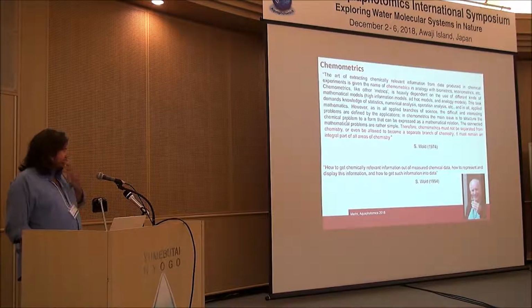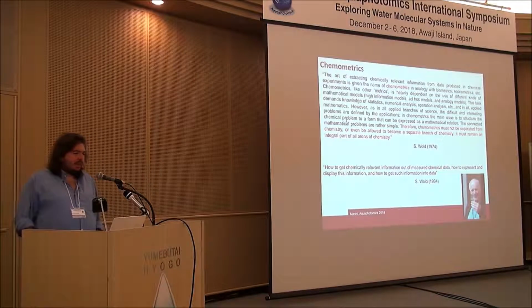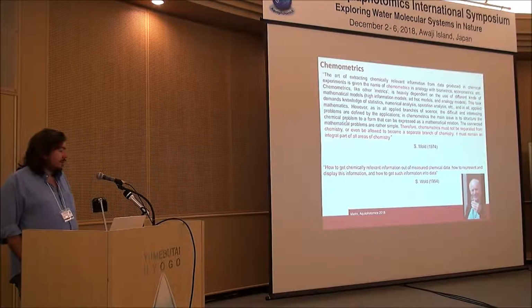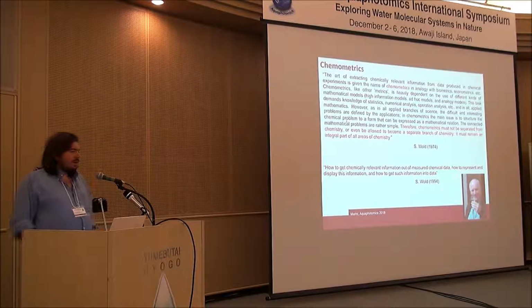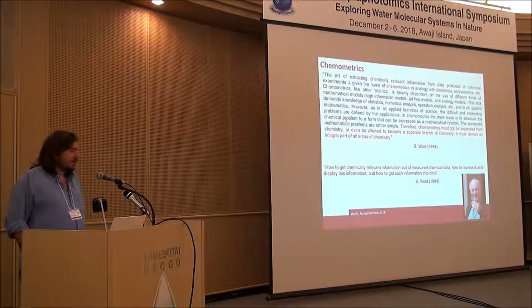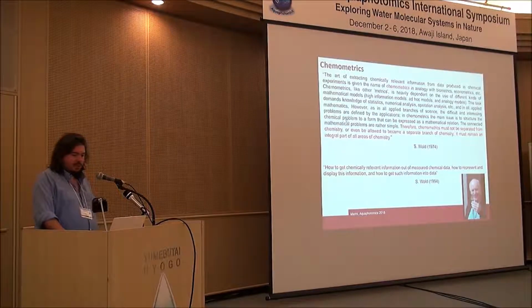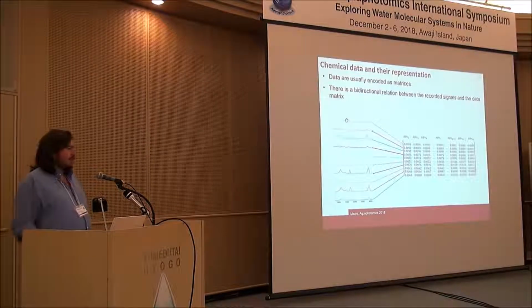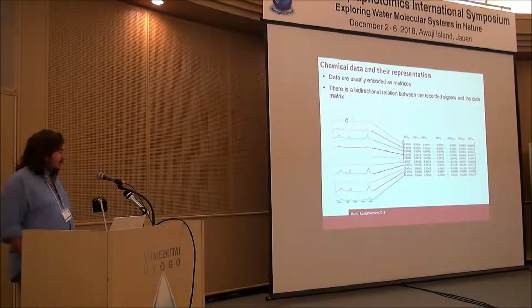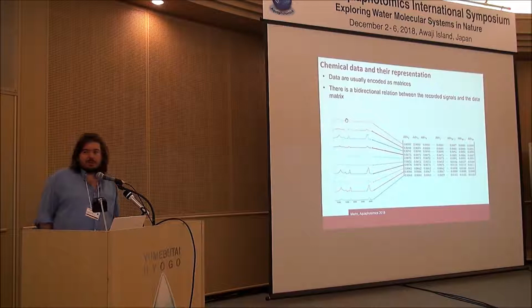Chemometric tools, that means the statistical and mathematical approaches that are applied to the experimental data, in this case the spectroscopic data, for extracting relevant information, are a relevant part of the toolbox that can be used for processing the experimental data within the context of aquaphotomics. And of course, we have many ways of representing the experimental data. The way that we are mostly familiar with is in the form of a spectrum, and of many spectra when we are dealing with different samples.